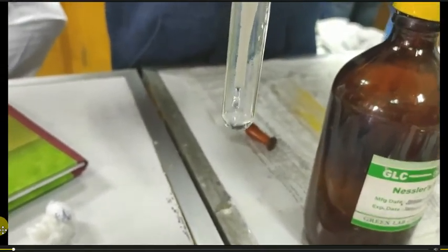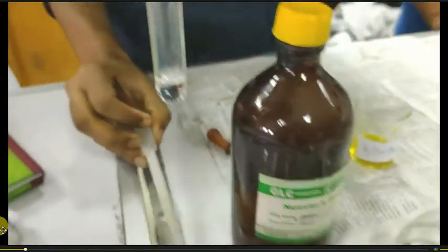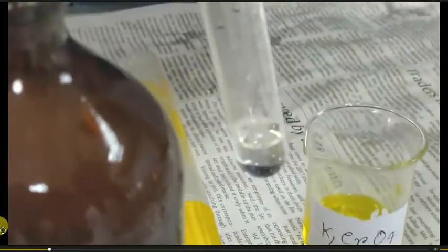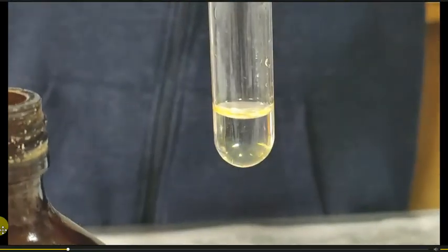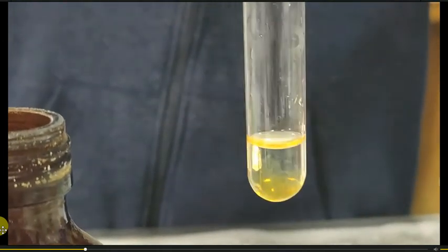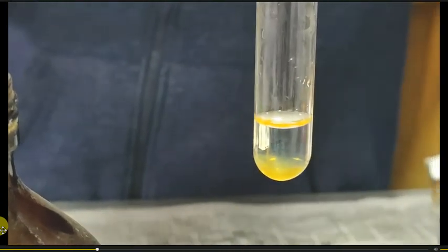Into this sample solution, we are going to add Nessler reagent. This Nessler reagent will cause brown precipitation, which is indicative of the presence of ammonium plus ion. Brown precipitation. There is a brown PPT at the end of the test tube and this is indicative of the presence of ammonium cation.